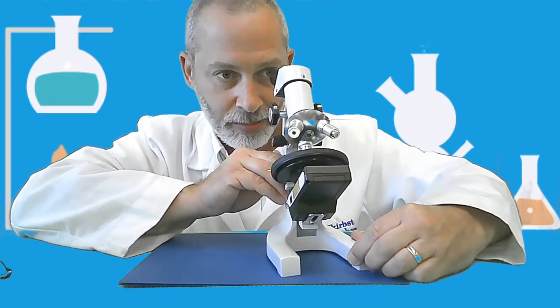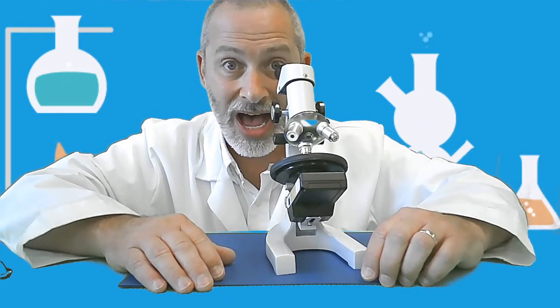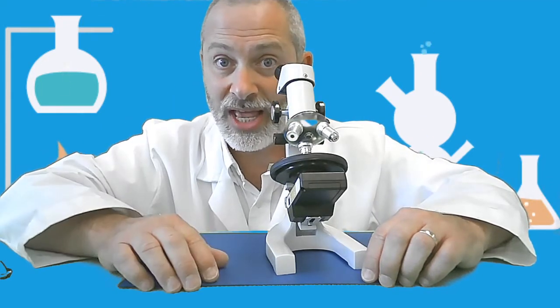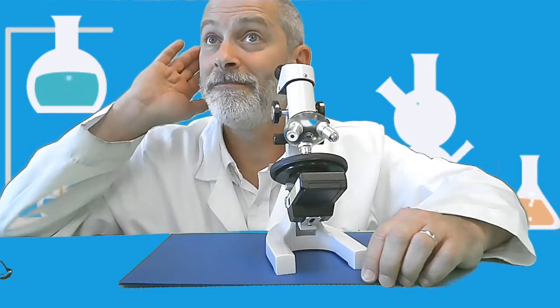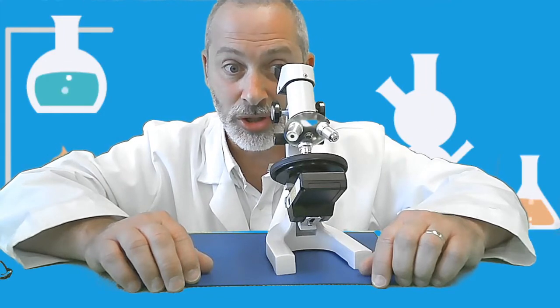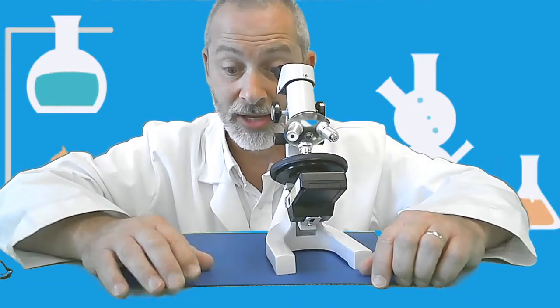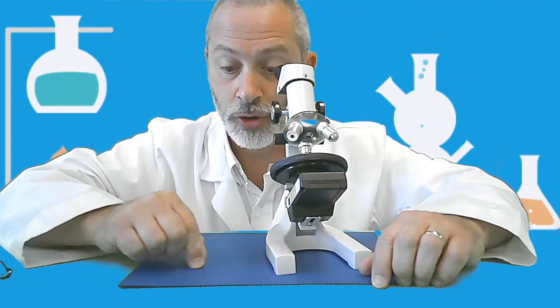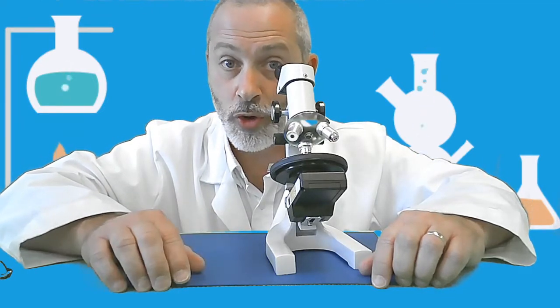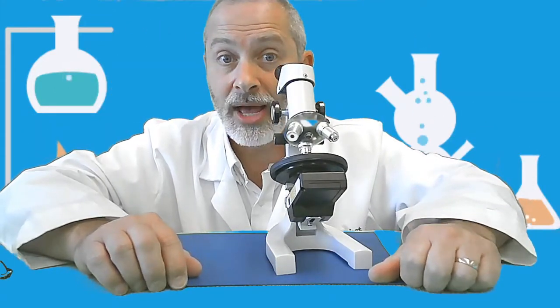In fact, I am positioning it now comfortably. And oh boy, who remembers what eye you should be looking with into your eyepiece lens? Which eye, everybody? The dominant eye. So your dominant eye is looking through the microscope. Your non-dominant eye is open as well so that you can actually see in your book, and you can actually be drawing while you're looking back and forth with both eyes open so that you are not straining either of your eyes.